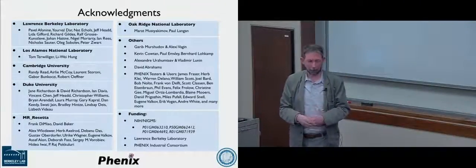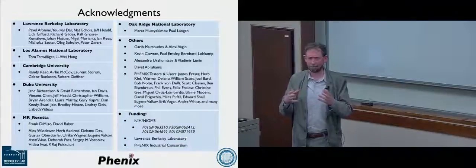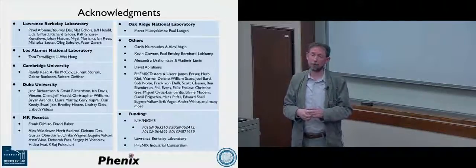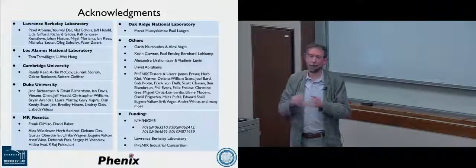Having said that, I certainly worked with the PDB a long time ago to develop the appropriate tags for information, so that one could deposit things like the model you used for molecular replacement, and statistics about the molecular replacement process. Same thing for phasing.